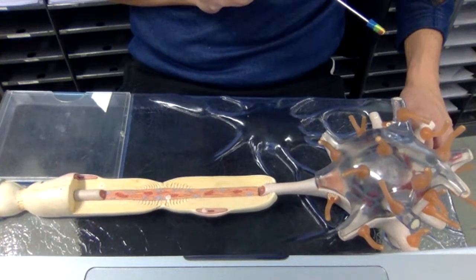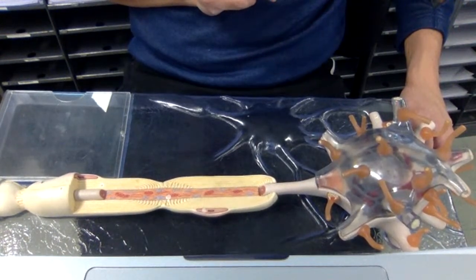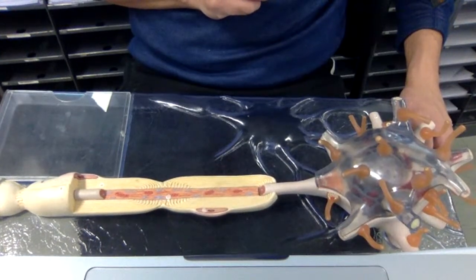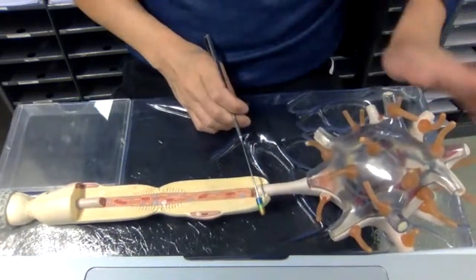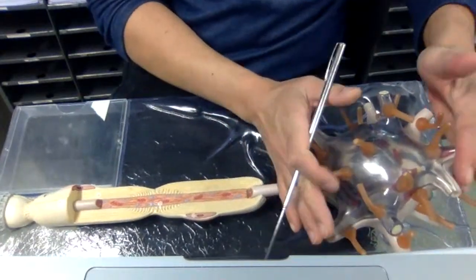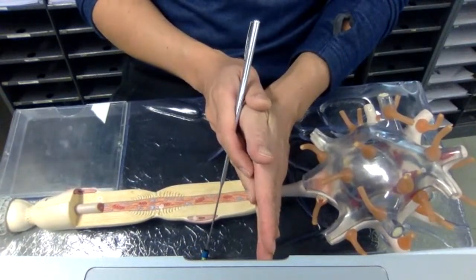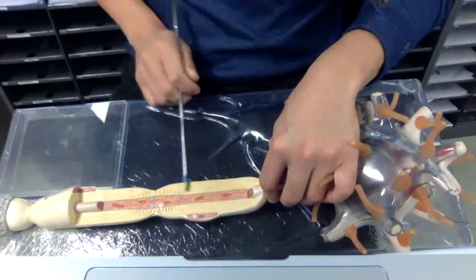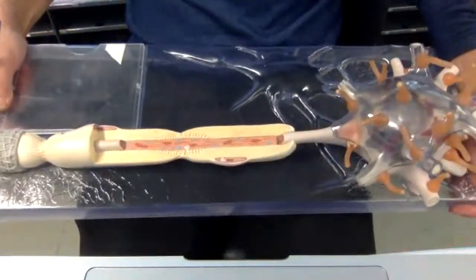The choices again are special sensory, somatosensory, inter, and motor. That's right. This is a motor neuron. So that means the cell body and dendrites would be somewhere in the central nervous system, whether it's the brain or spinal cord. This axon extends out into the periphery, which is why you see Schwann cells. So this is representing a multipolar motor neuron.